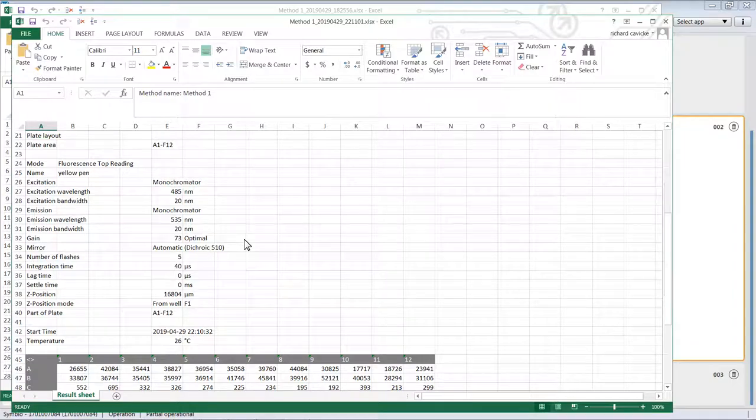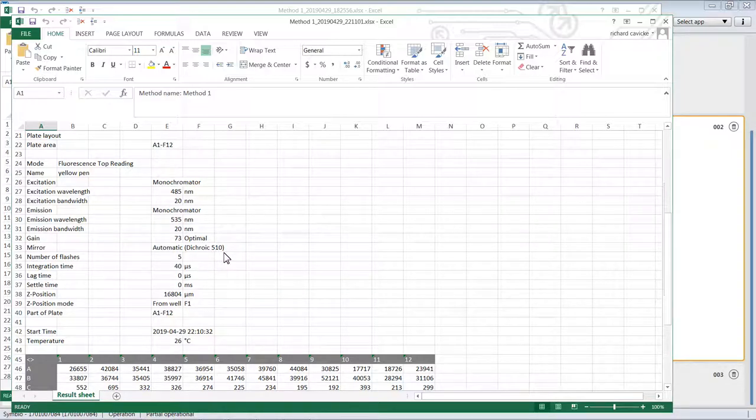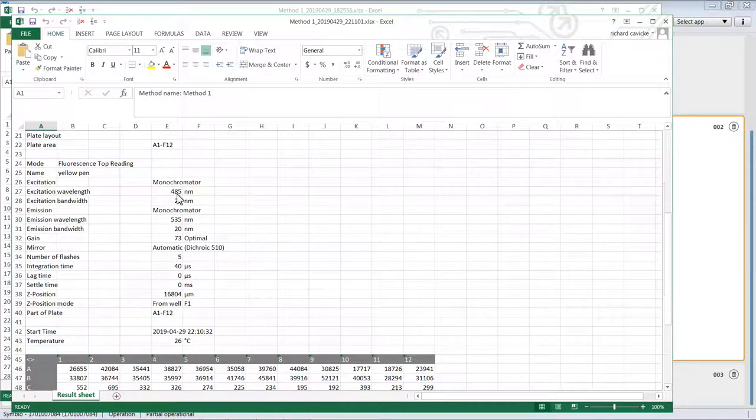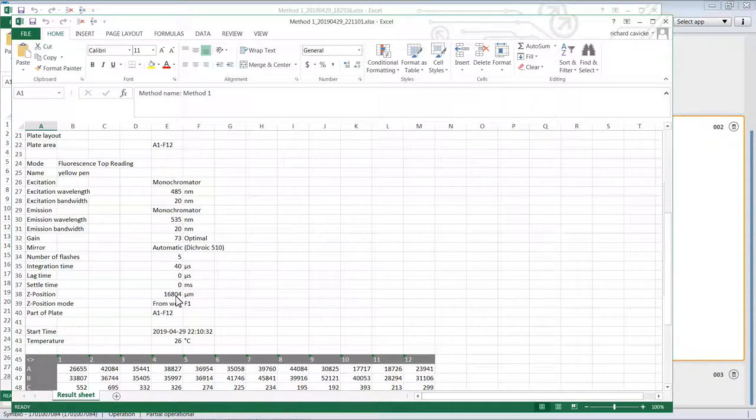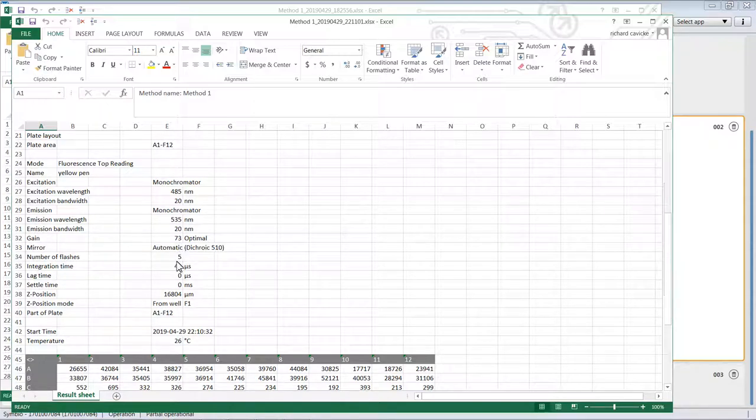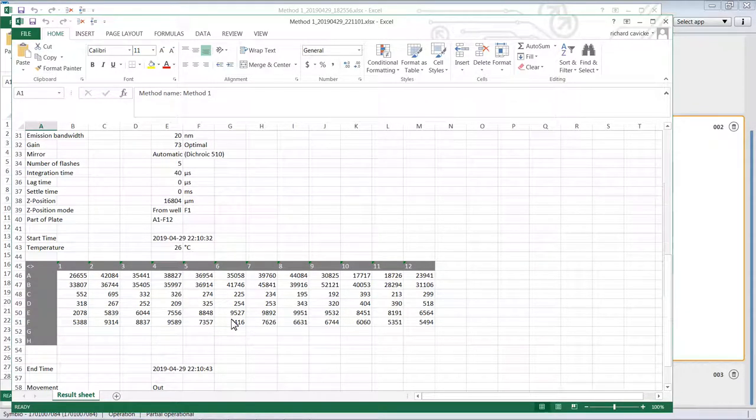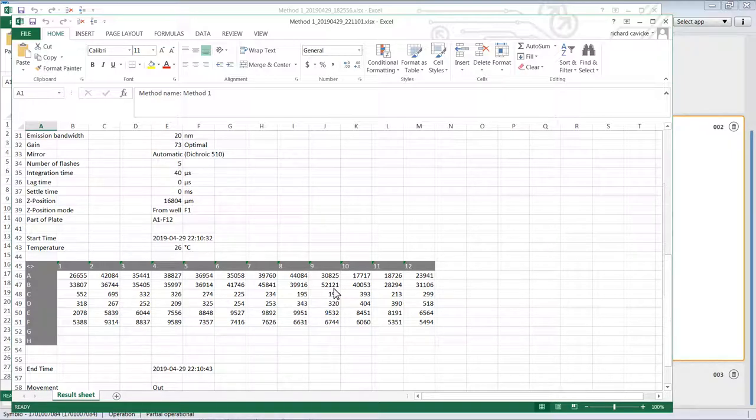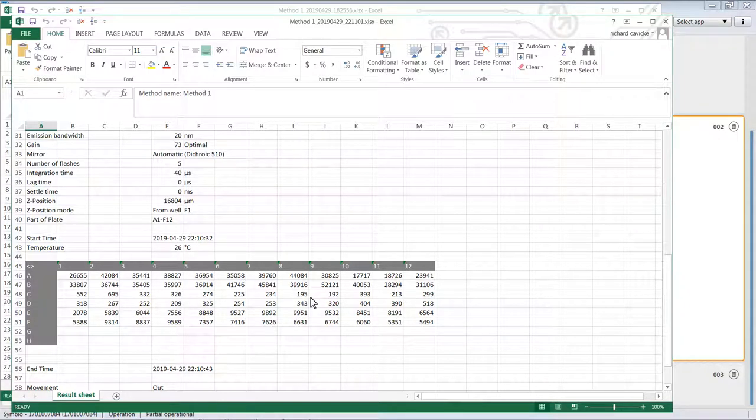We can see that the gain it picked was 73, so it's above 60, so that's good. It's showing us that it used the dichroic mirror, the 510. That makes sense because a 510 mirror would be able to split the light between 485 and 535. The Z position it reported is here at 16,804. So you could, if you wanted to read these plates again, go back and fix the gain manually at 73 and the Z position at 16,804. Here's the data. We can see that we've got values upwards of about 52,000 here, and some weaker looking signals. This is a good example of how there's a nice spread of signals between low and high.